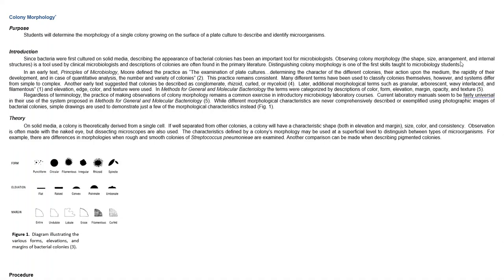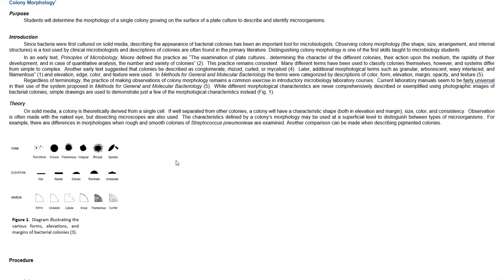These are all basically what I've just finished saying. The examination of plate cultures, and so on. You know what? You guys can read that. It's really only telling you what we just said. When we see these on our plates and we describe them, we can use those to look up the bacteria to which they could potentially belong, and then we use our biochemical tests.